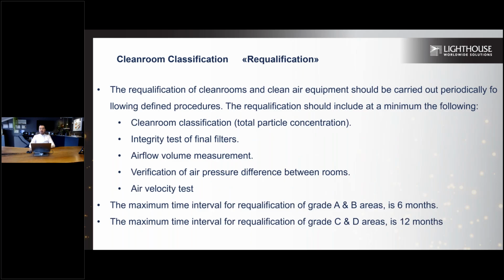Cleanroom classification, the requalification periods. GMP Annex 1 says the requalification of cleanroom and clean air equipment should be carried out periodically following defined procedures. The requalification should include at a minimum the following: cleanroom classification, total particle concentration, non-viable, integrity test of final HEPA filters, airflow volume measurements, verification of air pressure difference between rooms, and air velocity test.